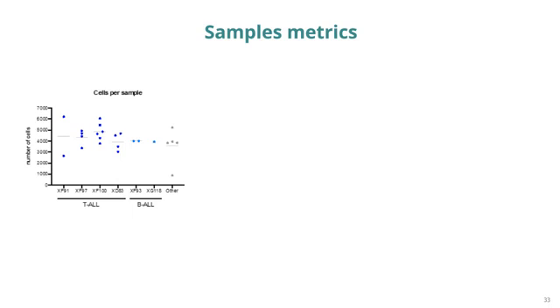On average, we obtain about 4,000 cells. A maximum is a bit more than 6,000. And you can see that for one of the samples, we obtained fewer cells, but it's because we loaded 3 times below the recommended concentration. So this was expected. But overall, we have already sequenced 100,000 cells that were loaded with the Tapestri platform.